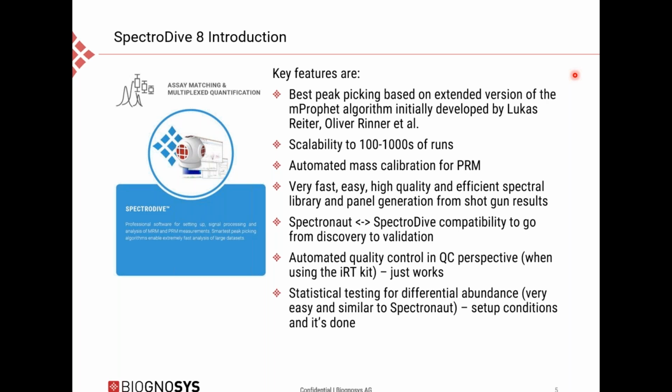Key features of the new software are: it has the best peak picking algorithm, which is based on an extended version of the mProphet algorithm, initially developed by Lukas Reiter and colleagues. The peak picking algorithm is very similar to the algorithm we use in Spectronaut.